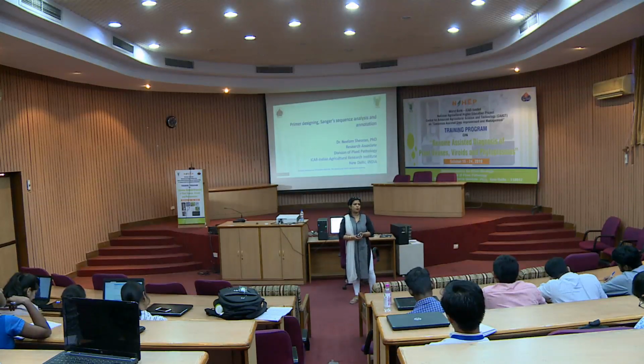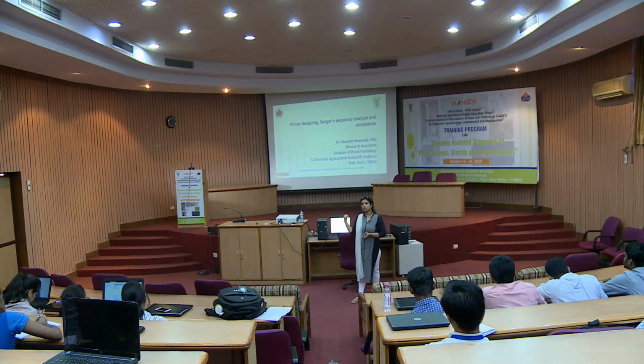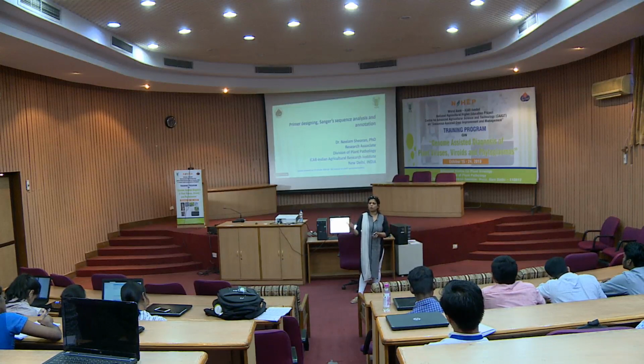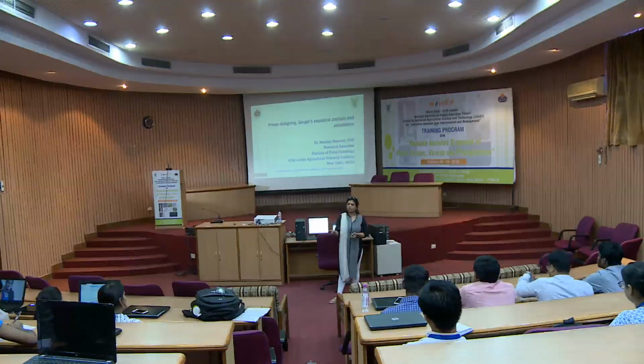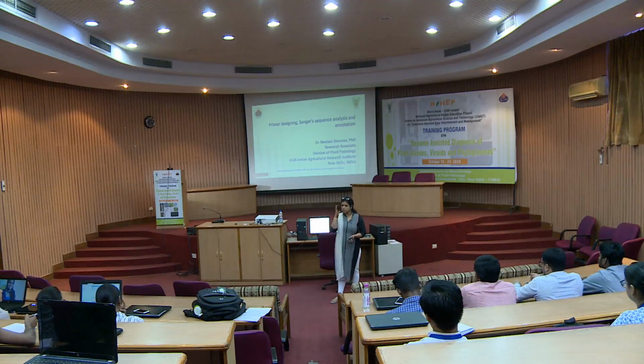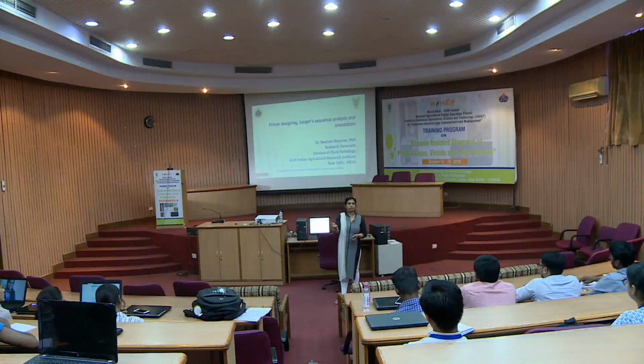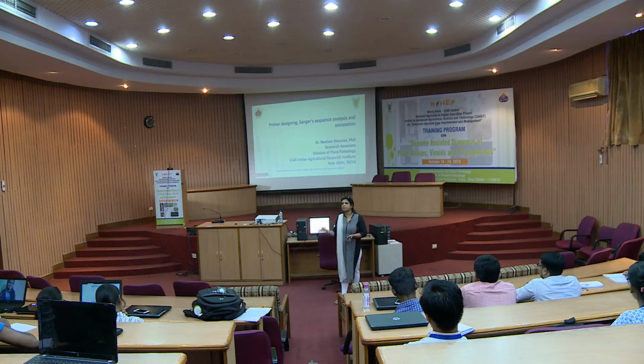So, these are the few features which I am telling you that you have to always consider whether you are using some software. Software does take care of all these features, but let us suppose you are designing it manually, then also you can look at the sequence and see whether it is GC rich or AT rich. There should be the optimum values, what I just told you. These values are optimum only, right? It is not that the values are this only, it can go beyond that for some specific sequences.